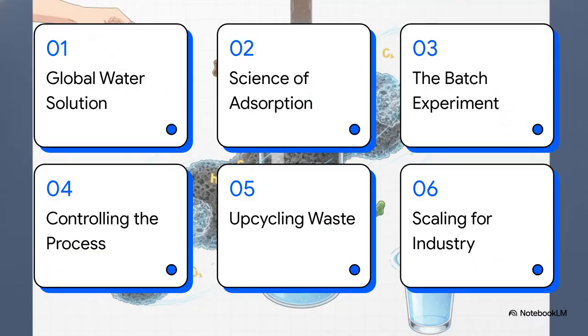So, here is our roadmap for today. We'll start with a global water solution, move into the science of adsorption, walk through the batch experiment, look at controlling the process, talk about upcycling waste, and finally, scaling for industry.